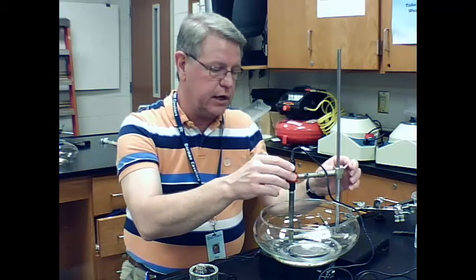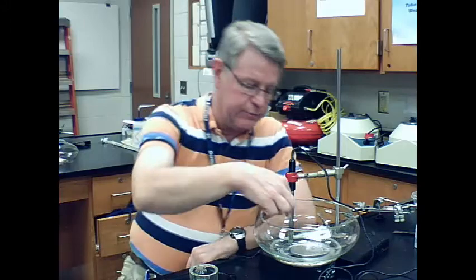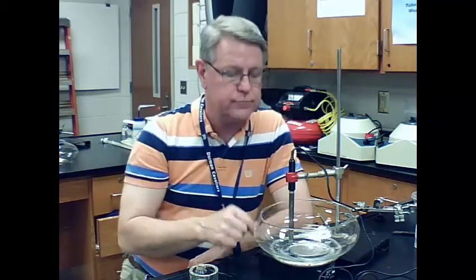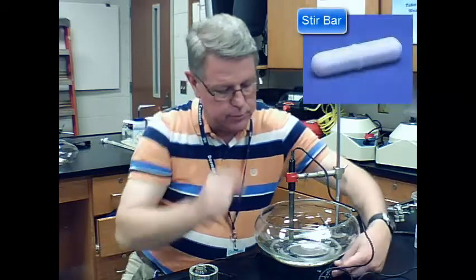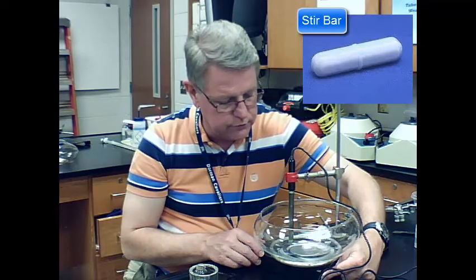so it'll give some stability to the bowl so it doesn't tip over. I've added the pH probe onto this ring stand with a clamp, and I've made sure that the pH probe is in the acid solution. And then I've turned, I've got a stir bar in here, and I've got it on, so the stir bar is constantly turning, so it'll constantly dissolve the new titrant solution that I add to the acid, and we get a good result.